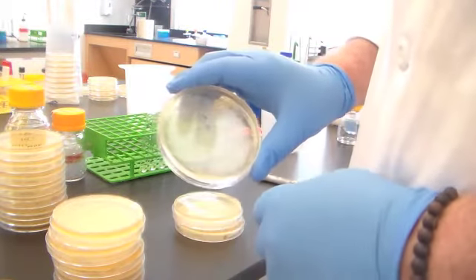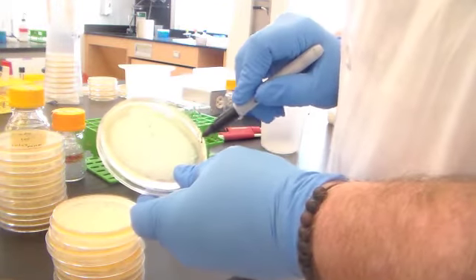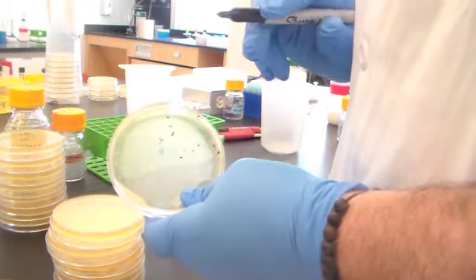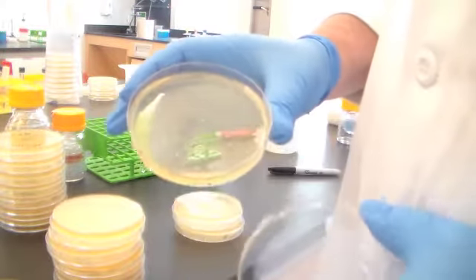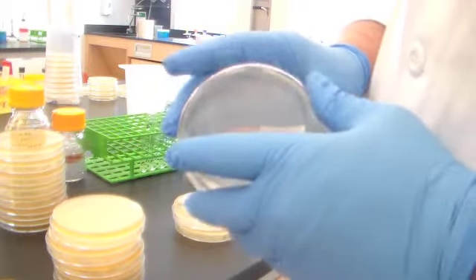Here's the 1-to-1 million dilution. So this would definitely be much more countable. So this would be 1, 2, 3, 4, 5, 6, 7, 8, 9, 10, 11. I've already bored you enough. I'm not going to make you count with me or watch me count this. But this would be a nice countable plate. This is hopefully what you're going to find somewhere in your dilution series.